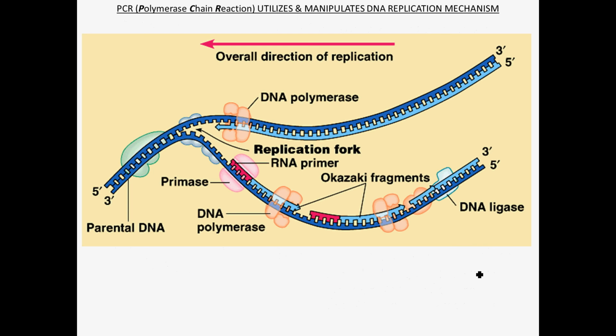So let's get started. Again, just a quick review of DNA replication here, where this DNA polymerase is making a complementary strand of DNA here in light blue to this template strand of DNA. This all started off by using, of course, a primer that DNA polymerase can then add to this 3' end, right? So the PCR is based off of this replication mechanism.